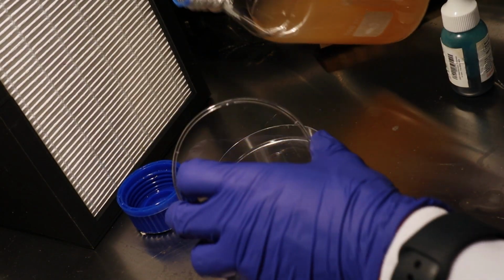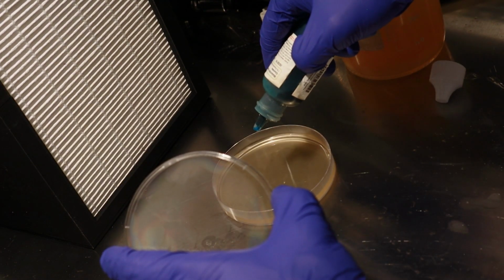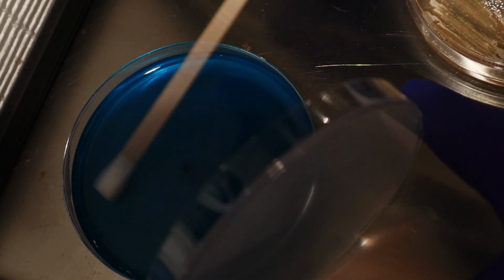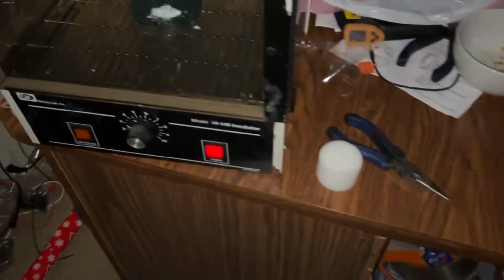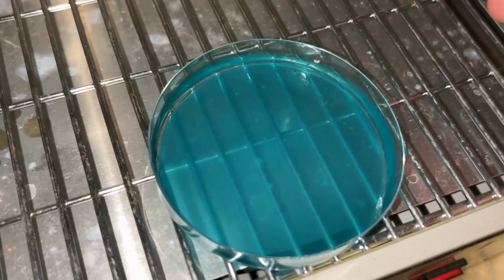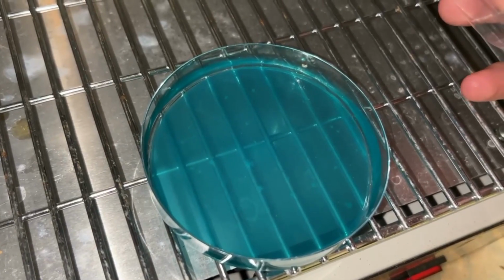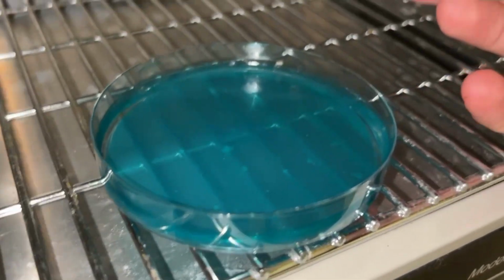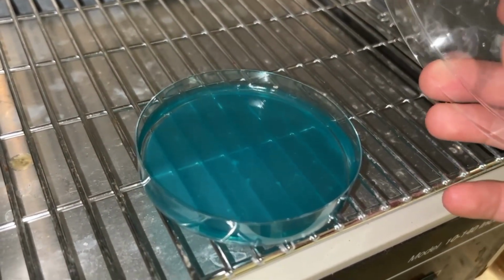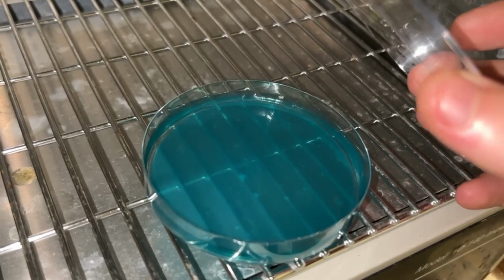I also read, while researching it, that apparently Streptomyces can decolorize malachite green. So I went ahead and poured another plate of Streptomyces agar, but this time added malachite green, just to see if it's able to decolorize it. So it's been incubating for around a week. Nothing grew, except contamination from the dye. That's it. Well, stain. So I probably added too much malachite green. That's probably what happened. Or it just was never going to grow in the malachite green to begin with.